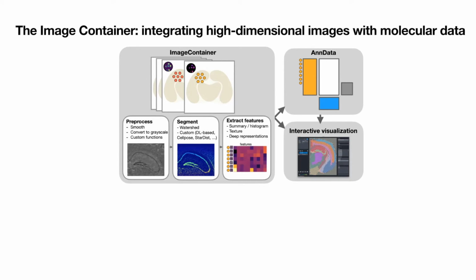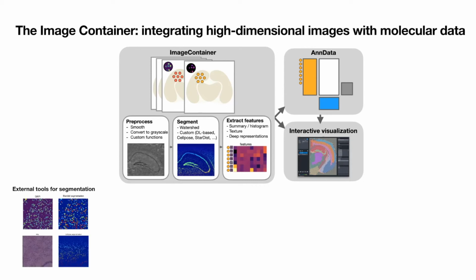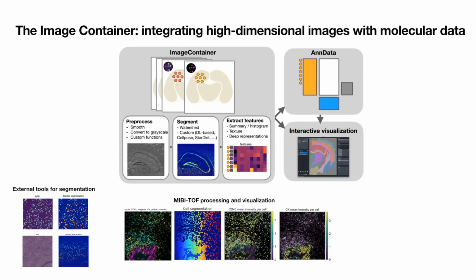In addition, we can also do interactive visualization, like I already said, for the image container. Oh, sorry, I forgot I had some animations here.